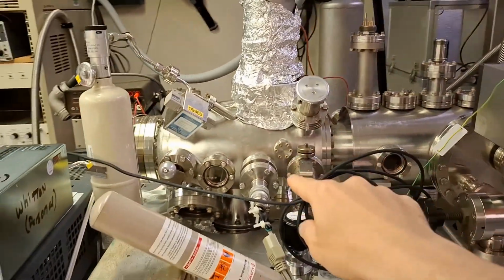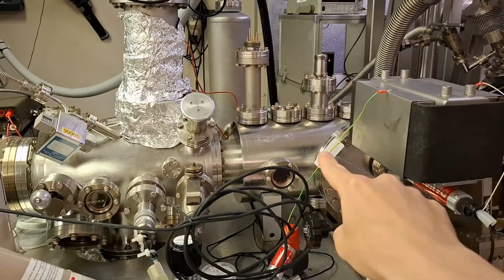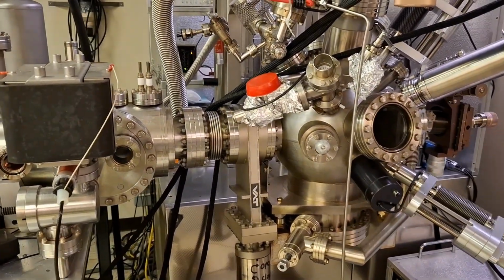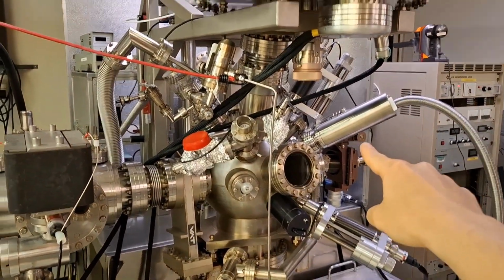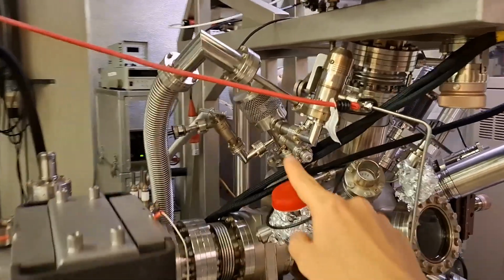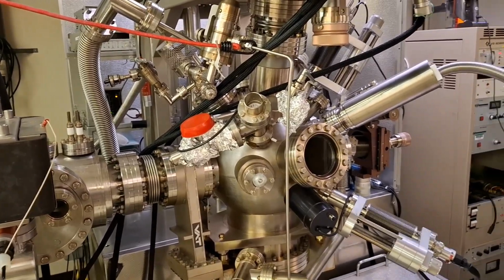Then if you want to make another film, I can move the sample to the second chamber, I can make the film here, and then I can analyze it in the third chamber. In the third chamber, you can see our X-ray source. This is the X-ray source and hemispherical analyzer. And we also have a UPS source here. And we can analyze the sample.